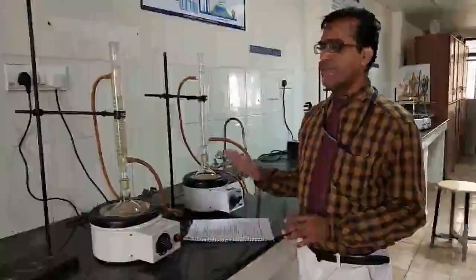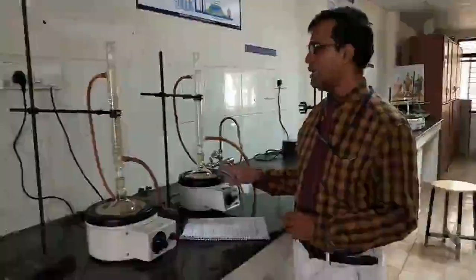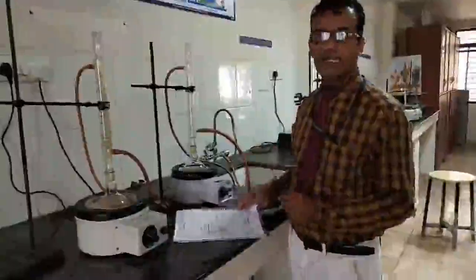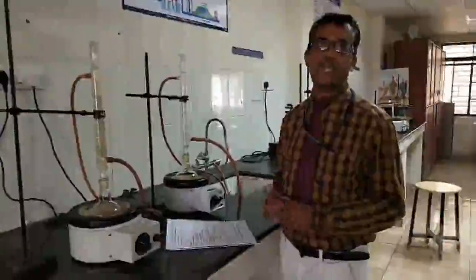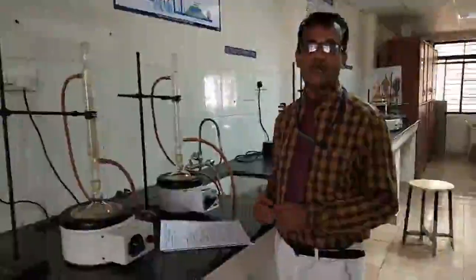cool it, and then add 150 ml of water in both the setups, and afterwards you add ferroin indicator, and then you have to titrate it with ferrous ammonium sulfate till you get the end point. So in the calculation part, we can see how to calculate the COD.